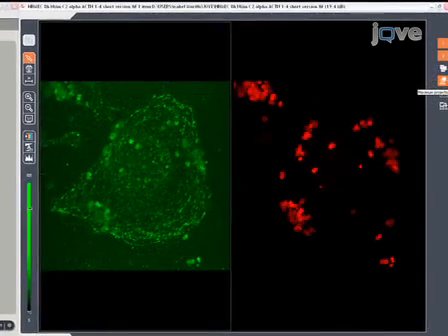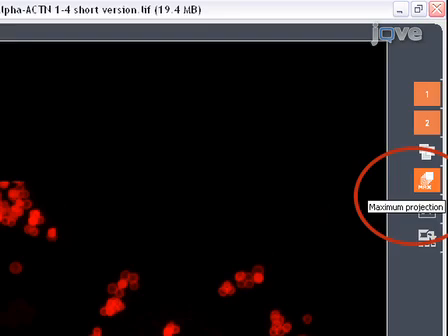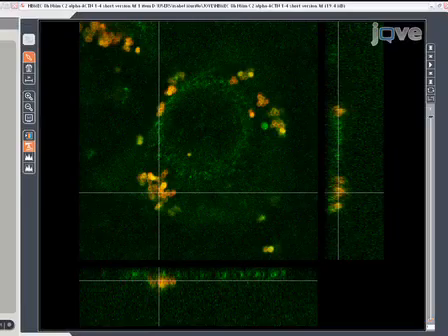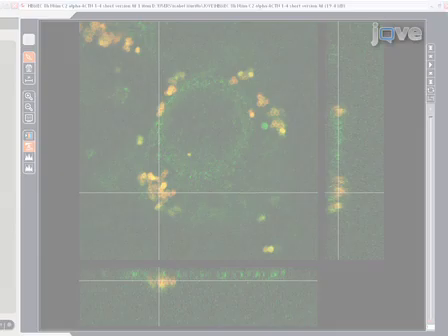For a 2D reconstruction required for visualizing possible co-localization, compile Z-stack source series using the maximum projection function. After acquiring the Z-stack source series, process your data to obtain an orthogonal image for visualization of intracellular localization of various elements.